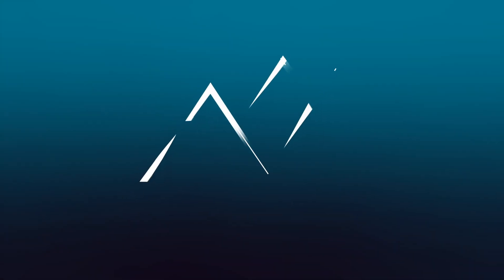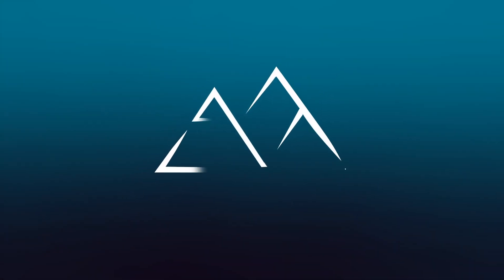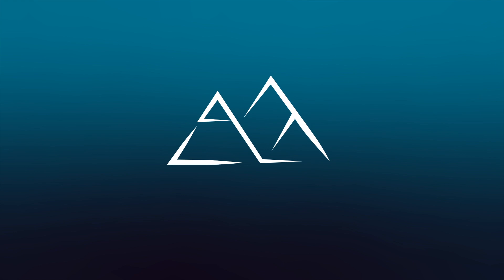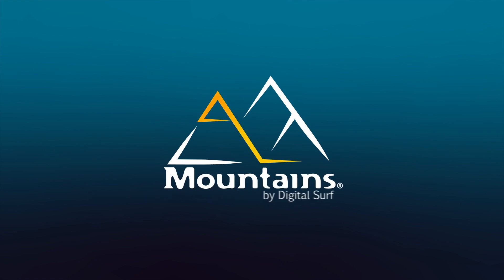Hello and welcome to the second video in this tutorial series on MOUNTAINS, DigitalSurf's industry standard software for profiler and microscope data analysis.